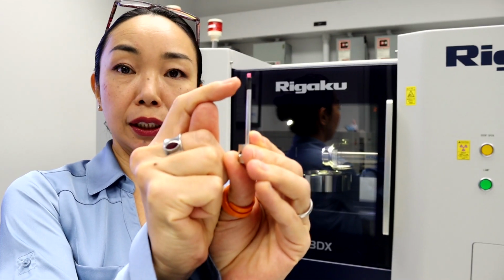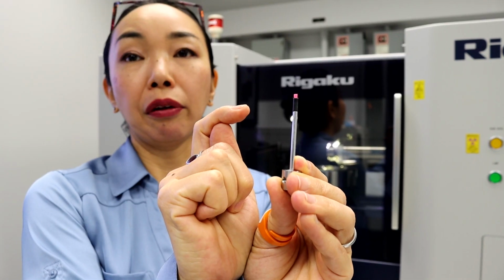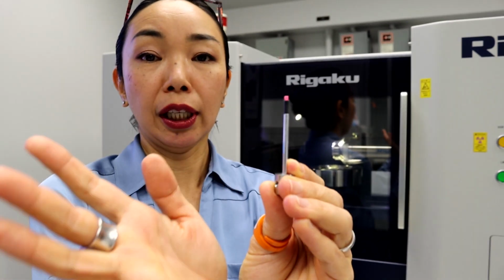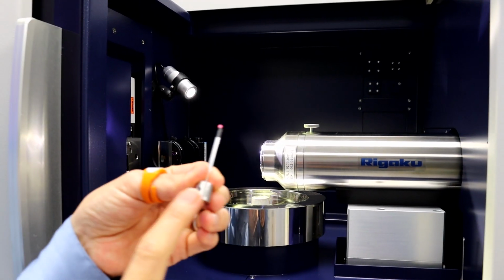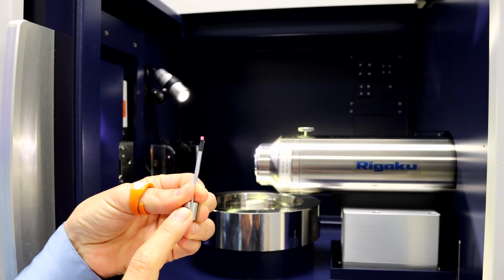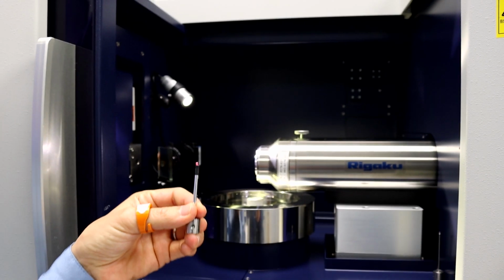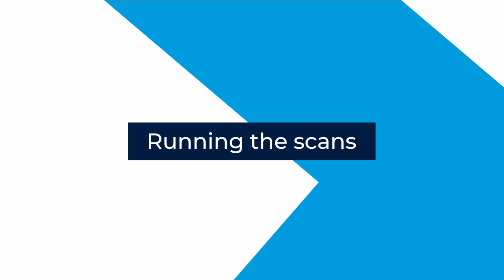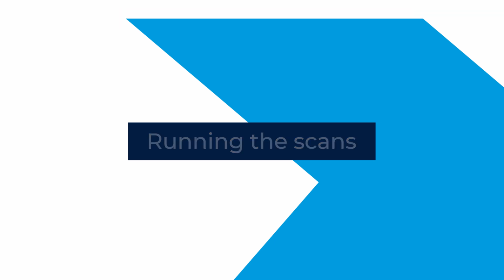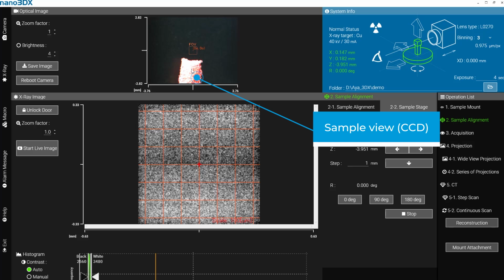This little pink thing at the top is a foam material and it has a lot of pores inside. We can't see them with our eyes, but if you use this X-ray CT scanner, you can see them in 3D. There is a sleeve here, where this sample base is going to be, and the foam sample is just sitting on top of this pin with a double-sided tape. So we just set the sample on the stage, and you can see the sample here. It's sitting a little short, but we'll adjust it in a second.